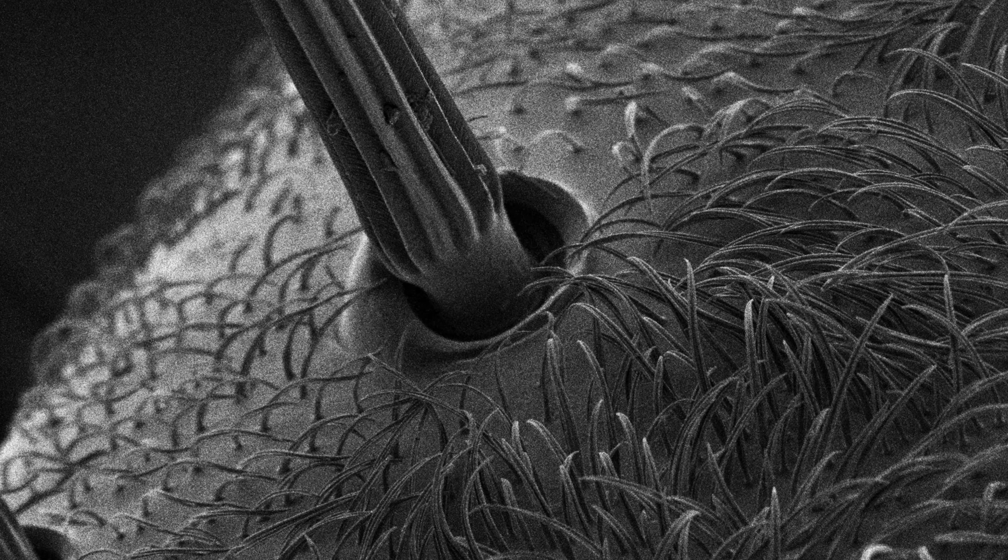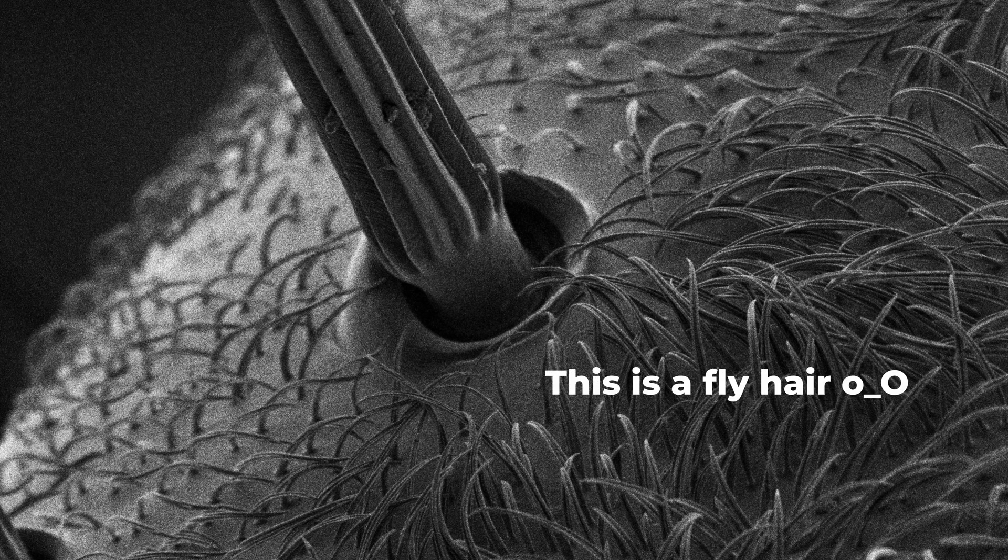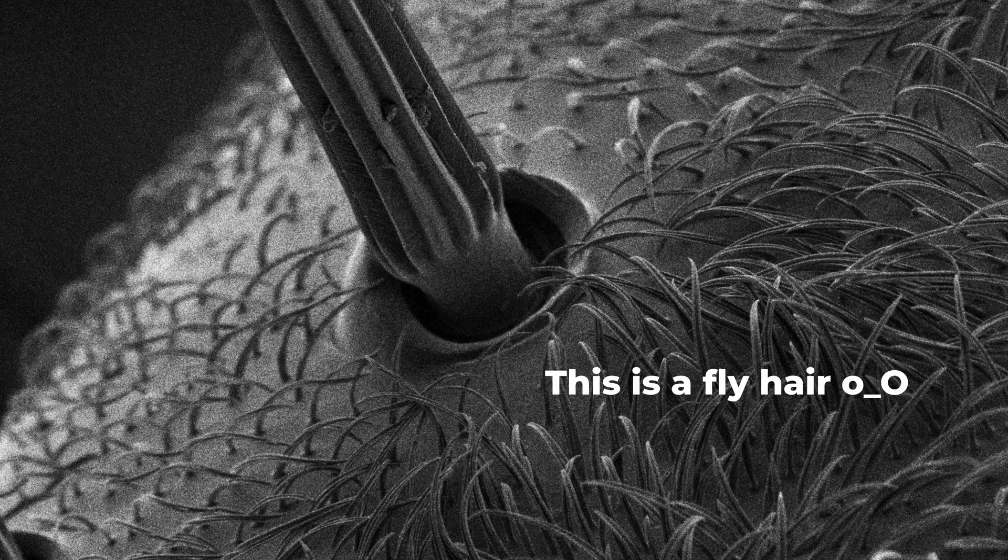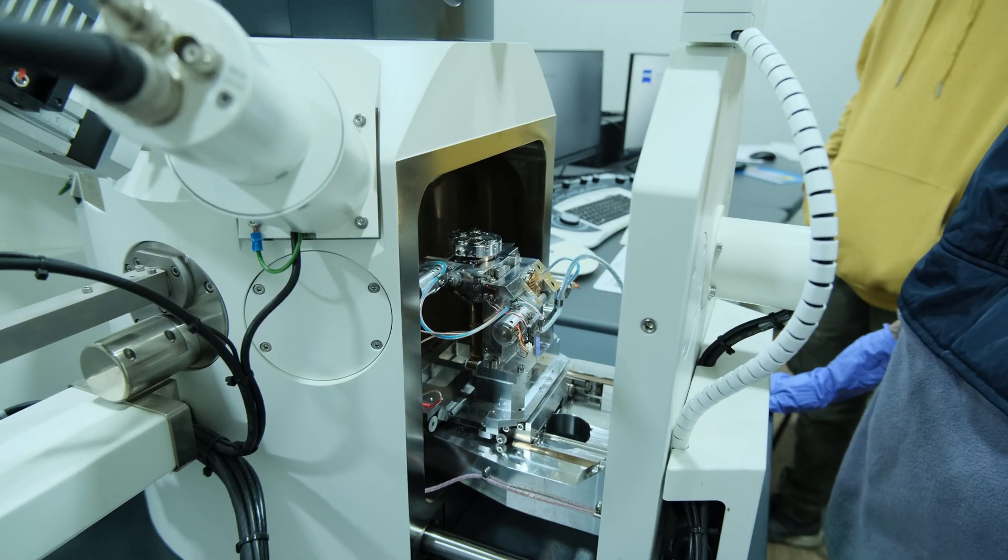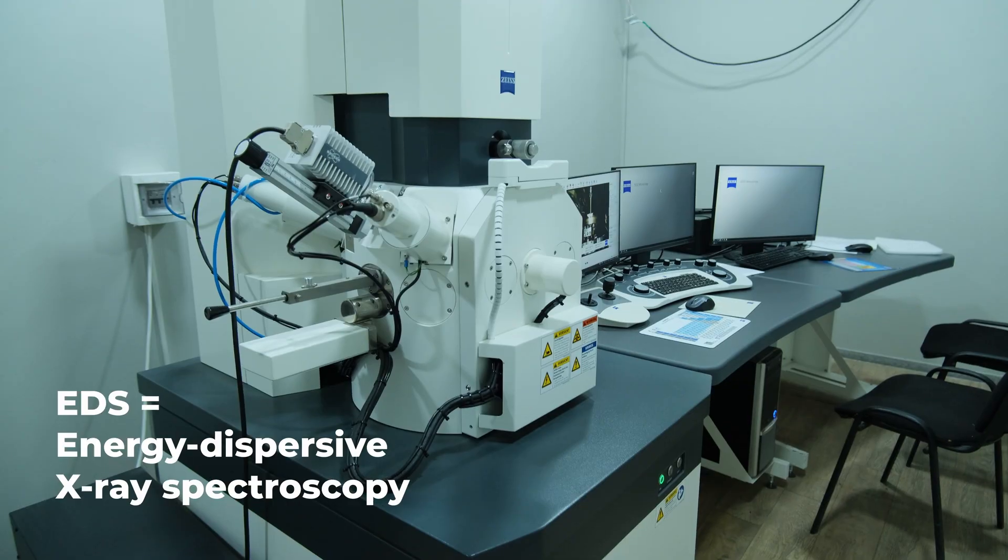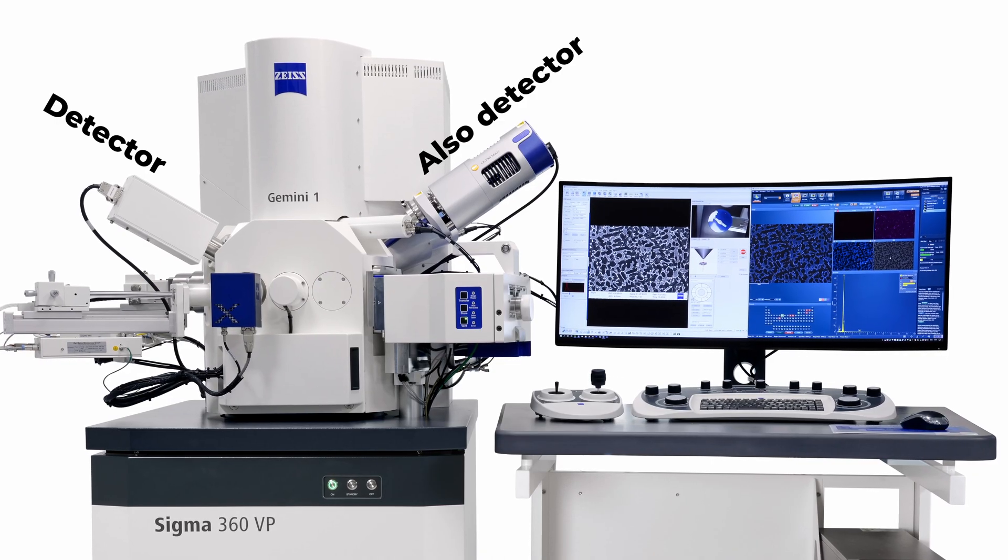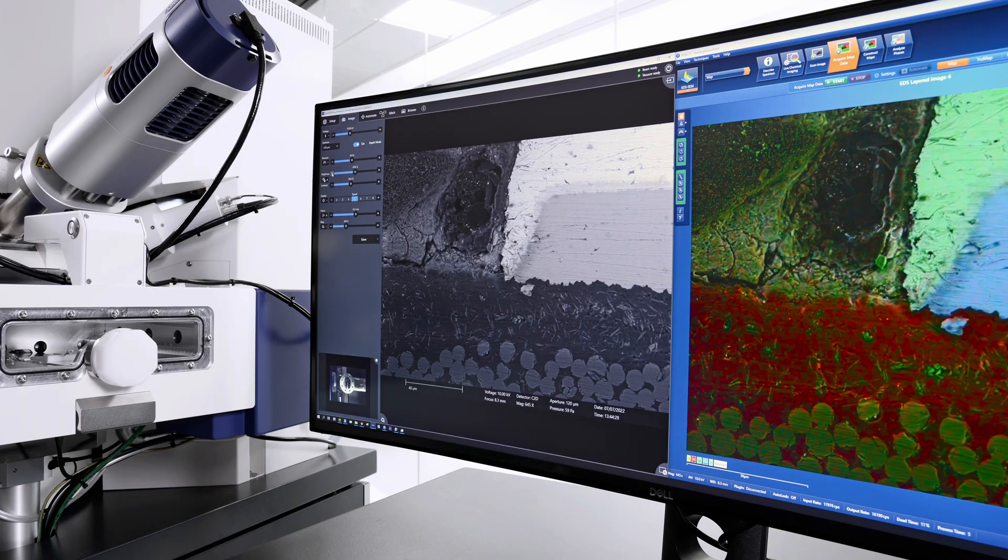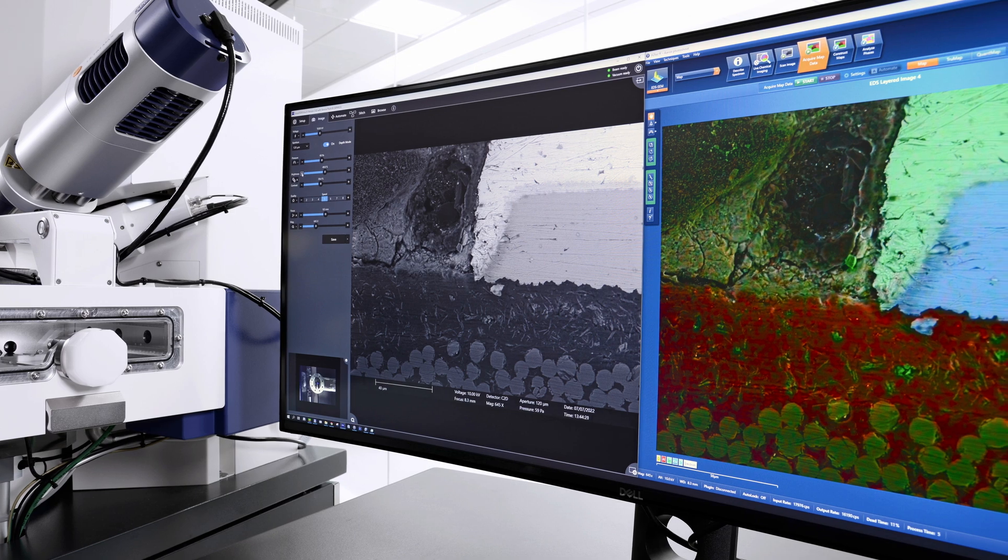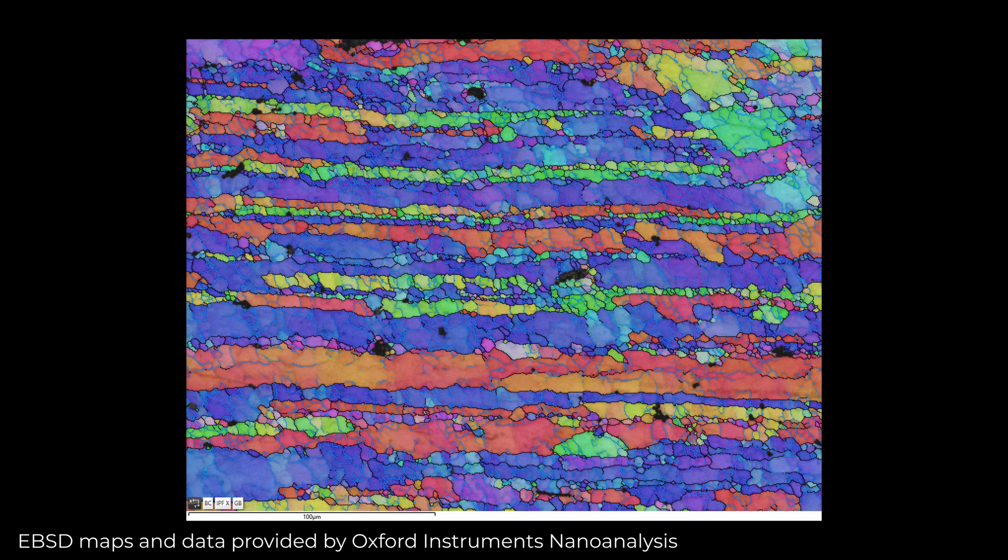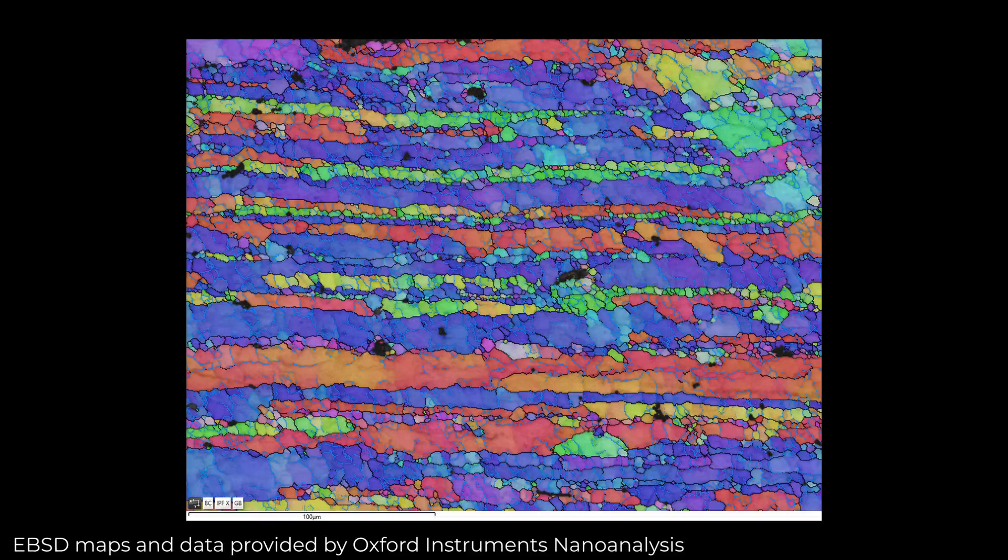We collect the electrons coming out of the material in order to produce the traditional SEM images. And the analysis of each interaction gives you the necessary data about the sample. So in SEMs with a large chamber you can install special detectors that will collect data about the different interactions of the electron beam with the sample, giving you information about the properties, elemental analysis, phase difference and other data of the scanned area.